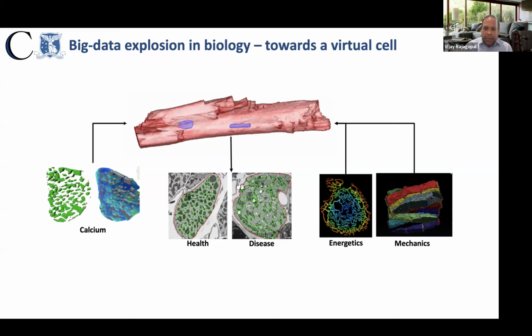With this interest in building a virtual cell model, we've been working on it for the last 10, 15 years, starting from my postdoc years. We've got some work done in calcium dynamics. We've been looking at energetics and metabolism, and we're also now looking at the organization of muscle cell myofibrils and how they impact cell mechanics as well. When we're building these models, one of the fundamental steps is that you need to create the geometric model of the cell.